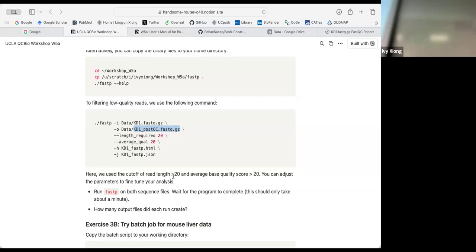Yeah, you should write out. It should, right? Maybe I need to... what's this?